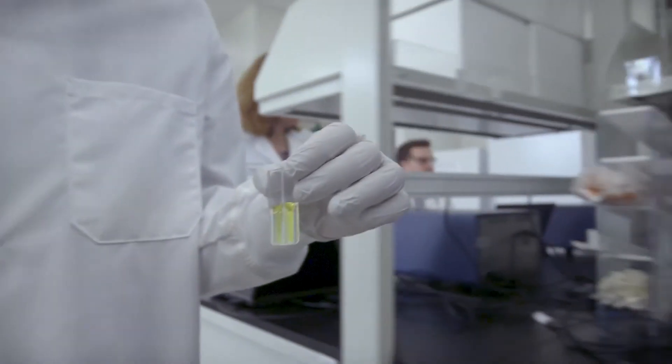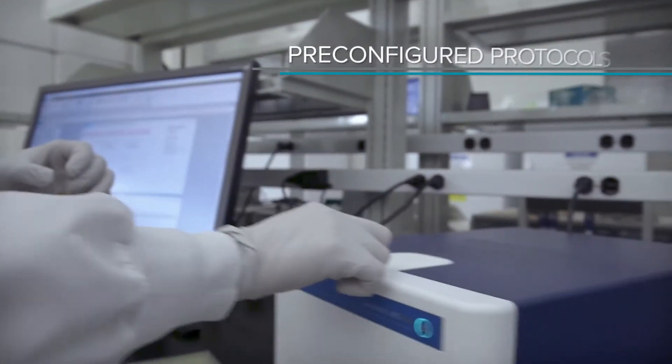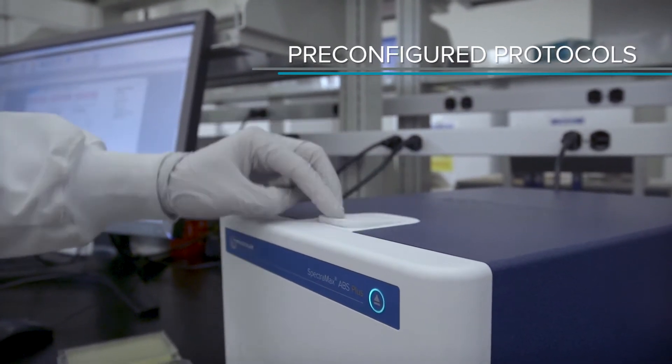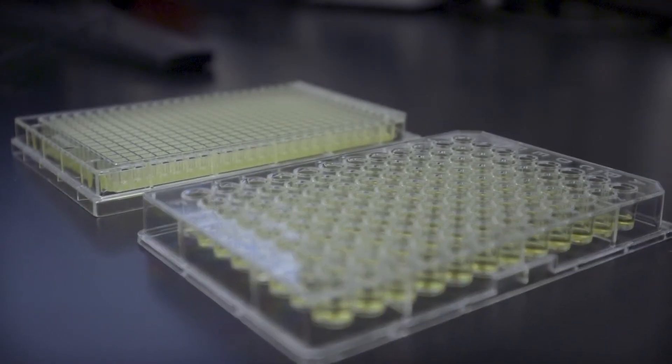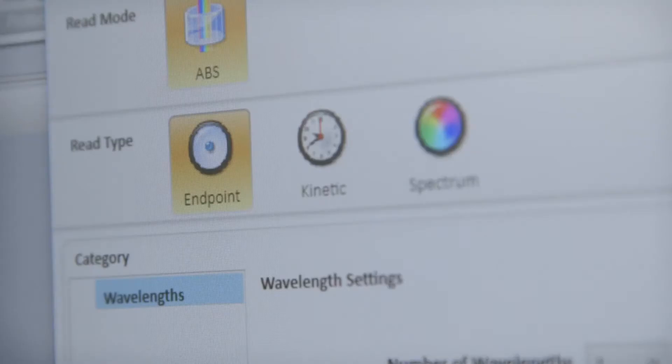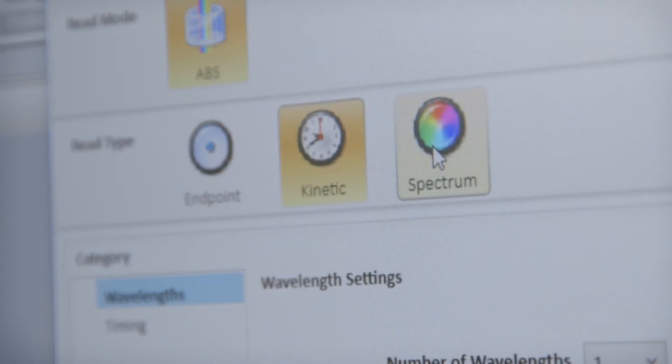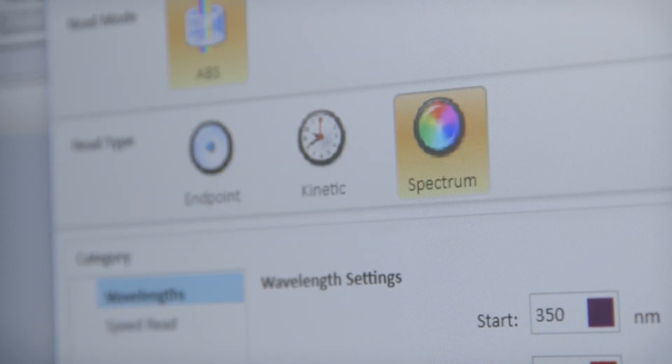Easy assay optimization lets users read a variety of sample formats from cuvettes to 96 and 384 well microplates in endpoint, kinetic, and spectral scan modes with temperature control.